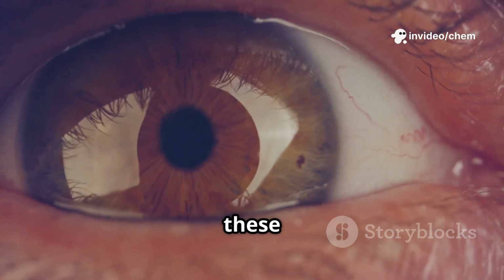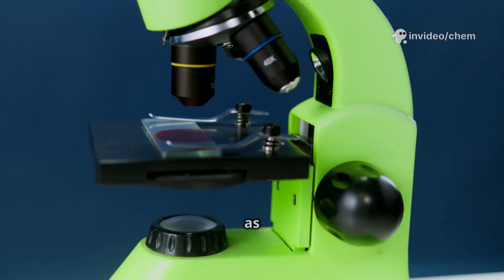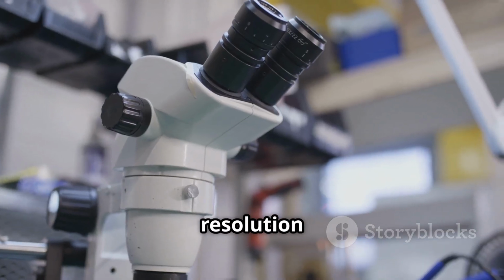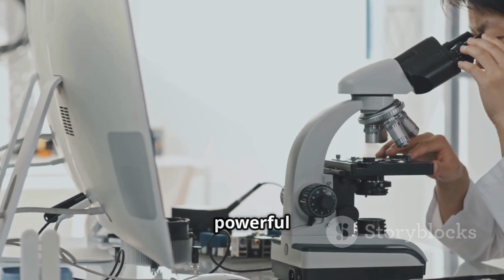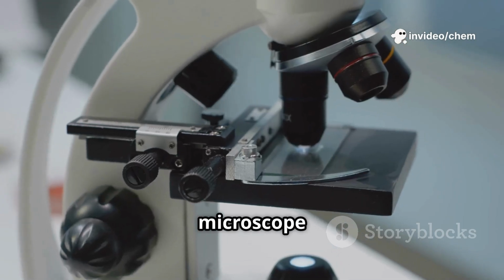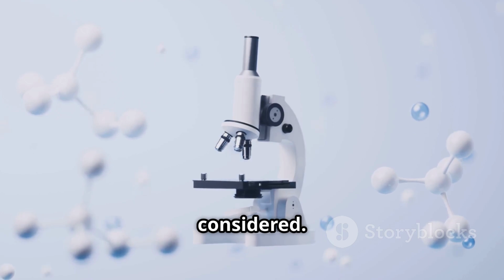Therefore, to overcome these limitations of human eyesight, the microscope was developed and used as an efficient magnifying tool. The microscope has much higher resolution and has been used as a powerful tool for studying and characterizing materials. The microscope resolving power depends on the quality and number of lenses used, but also the light wavelength or source to produce image is highly considered.